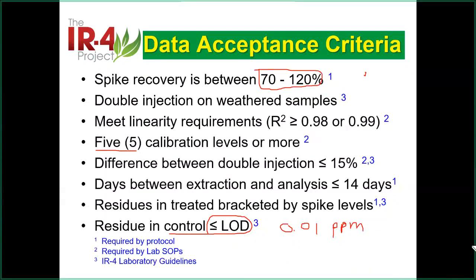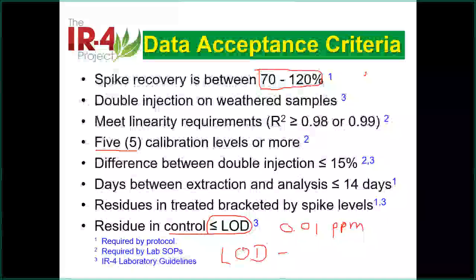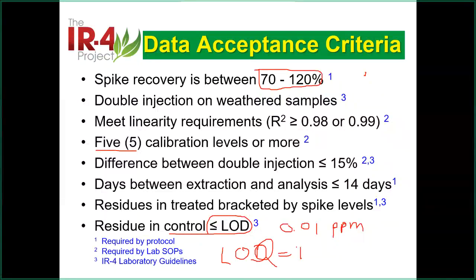LLMV is equivalent to LOQ. Typically LOQ is 3 times LOD, depending on what you say.